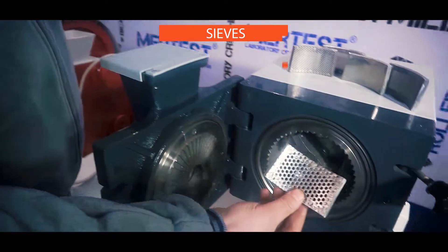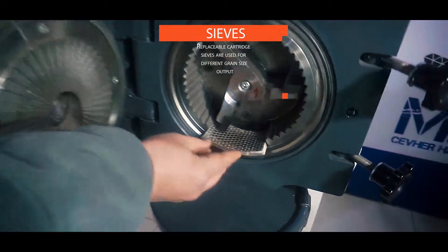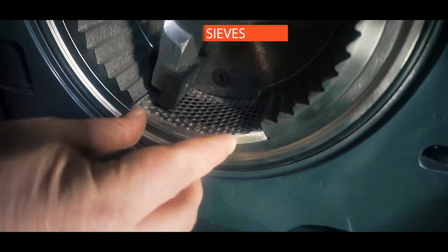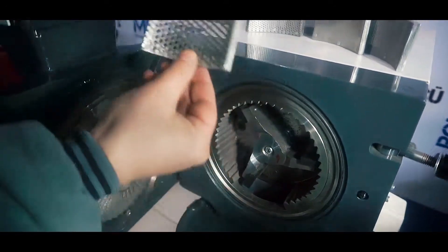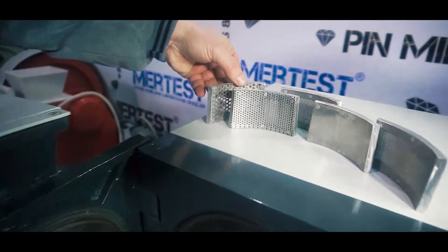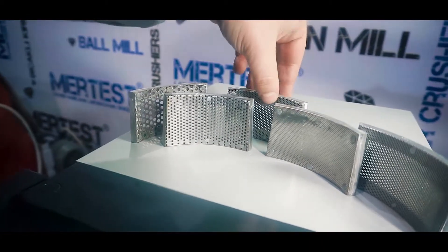Replaceable cartridge sieves are used for different grain size output. The sieve can be inserted into the tapered slot. The blades on the grinding rotor are also replaceable.